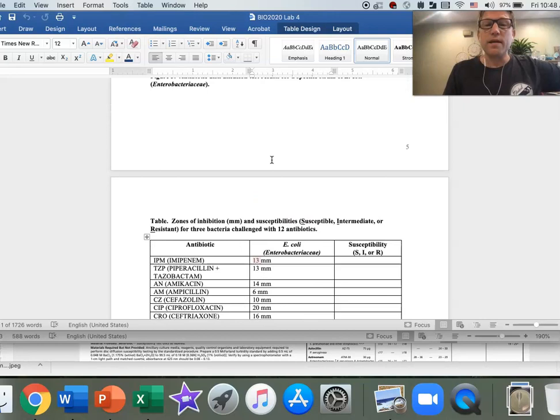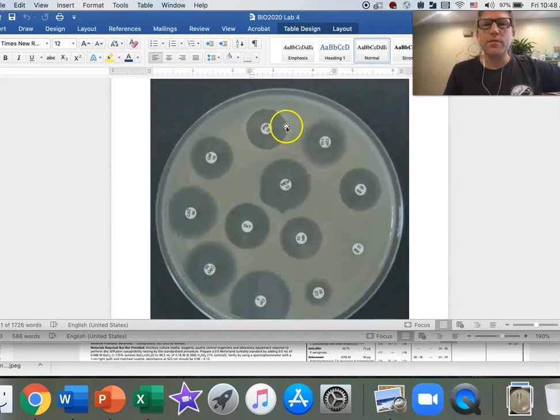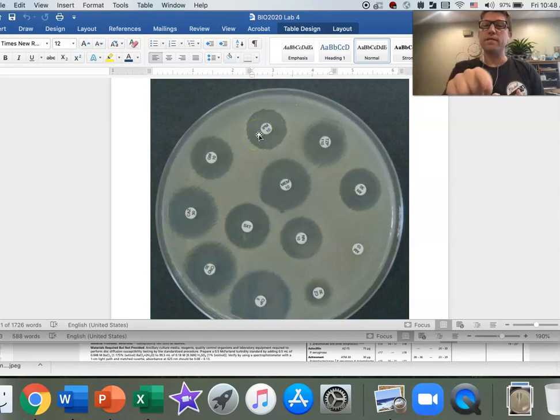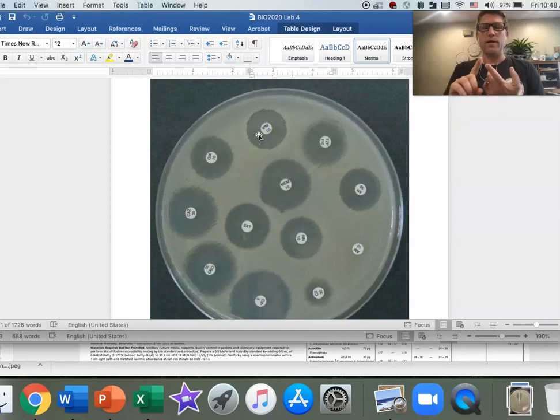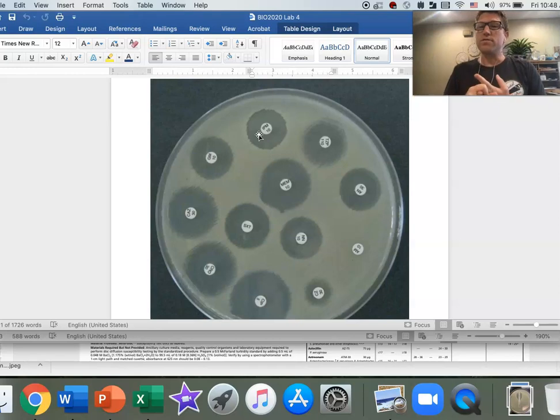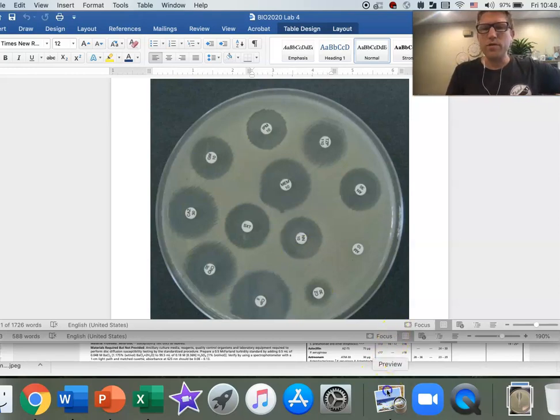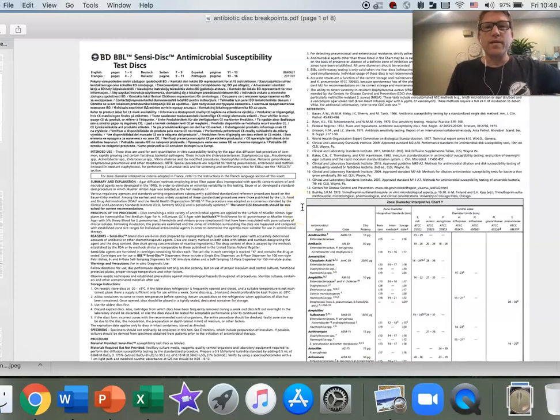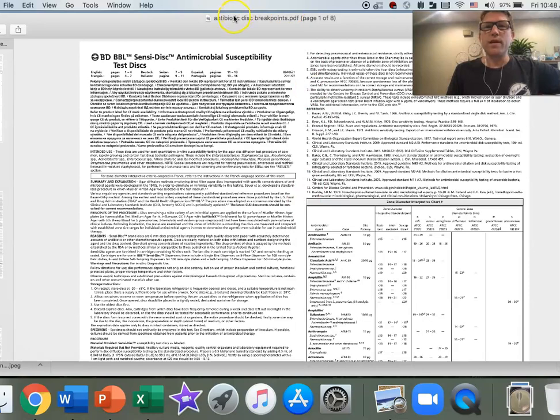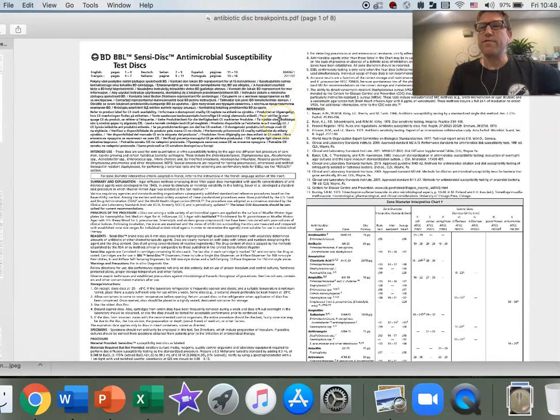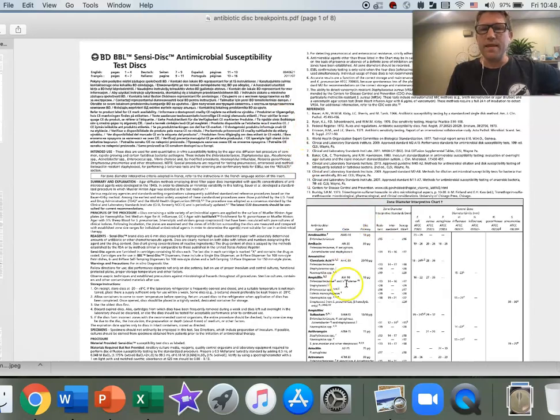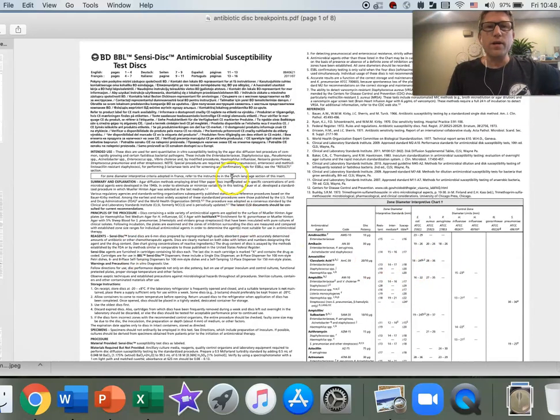Now what we want to do is take the 13 millimeter halo that we just measured and determine whether that implies that our bacteria are susceptible to the drug, resistant to the drug, or intermediate somewhere in between. So now we go to our antimicrobial susceptibility breakpoint chart. Antibiotic disc breakpoints is the title of the file, and you can find that on canvas.